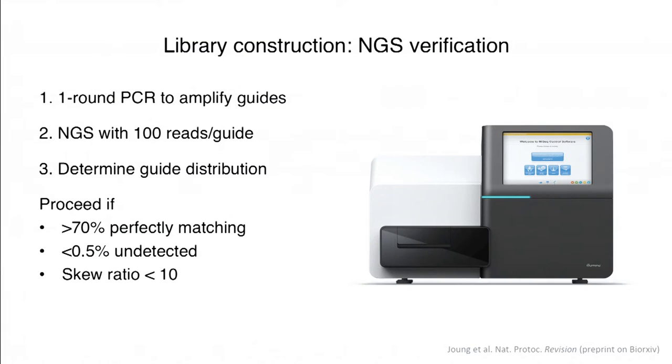And next, it's also very important to verify your sgRNA distribution by NGS before starting the screen, because the screen is a very long, arduous process, and so you want to make sure that your library is actually good going into the screen. So just in case anything goes wrong later, you can avoid that.